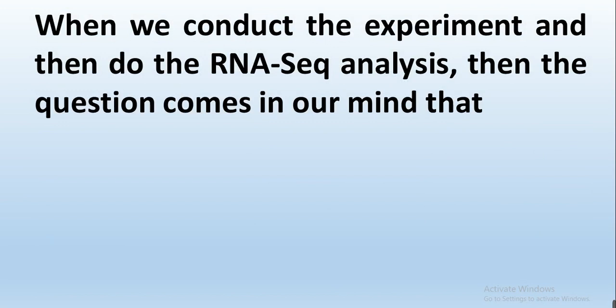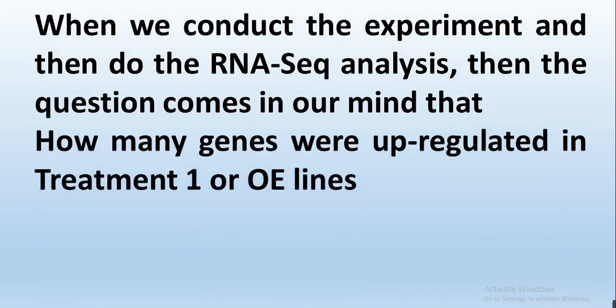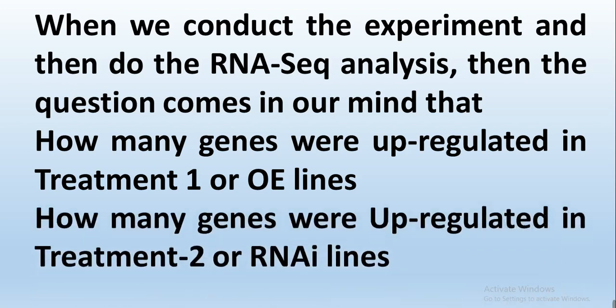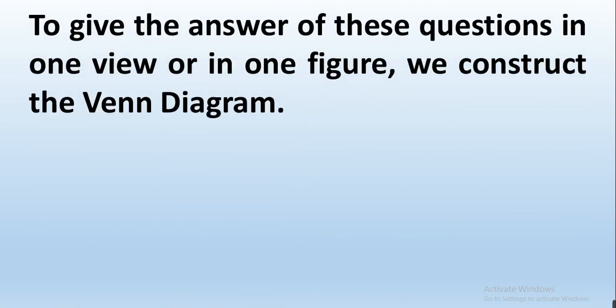When we conduct an experiment and then do the RNA-seq analysis, the question comes to mind: how many genes were upregulated in our treated sample one, or in our overexpressed lines, and how many genes were upregulated in treated sample two, or our RNAi knockdown lines? To keep the answer to these questions in one view or one figure, we construct the Venn diagram.